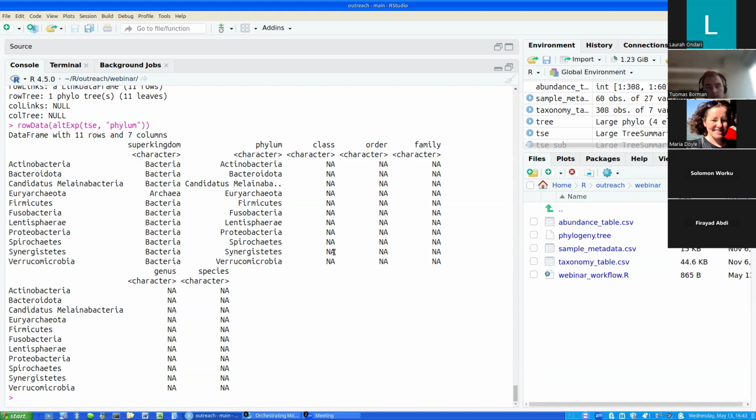We have to use ratios instead. So compare, for instance, bacteria A with bacteria B in statistical testing. And there are different transformations available, and from the online book you can find more information on those. But for the sake of example, we can do the relative transformation.